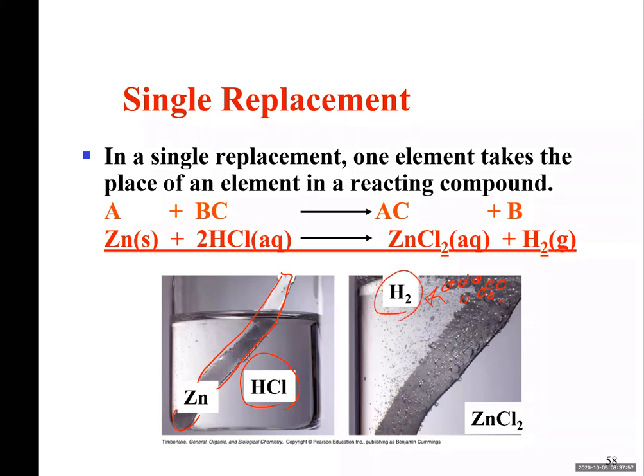Eventually, the zinc metal, zinc strip, is going to dissolve. And if you investigate, you'll see zinc is converted to zinc chloride. And you are going to observe this reaction.